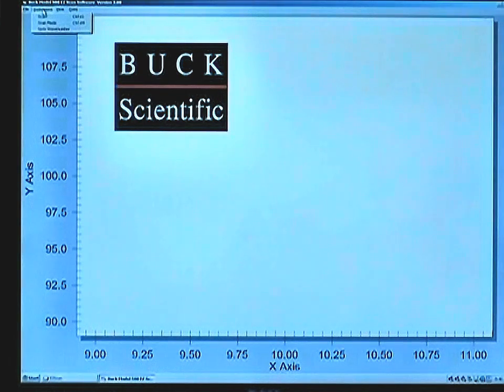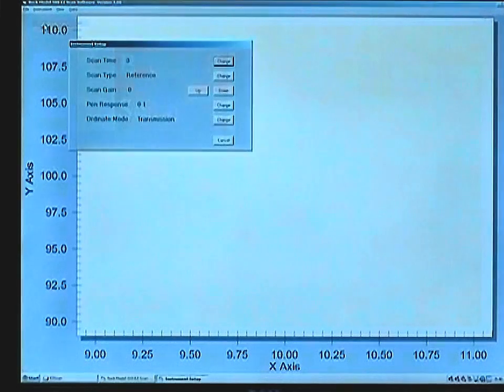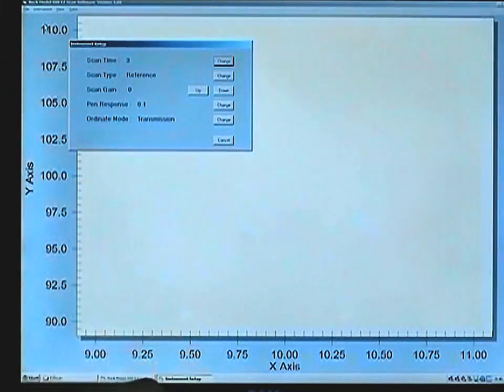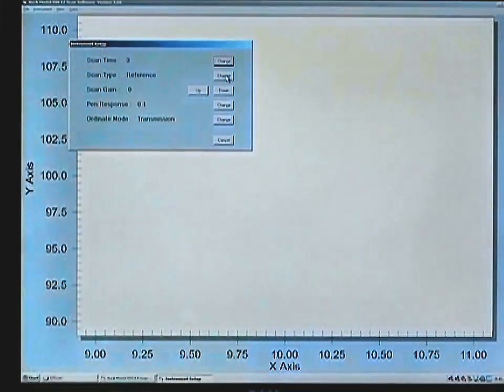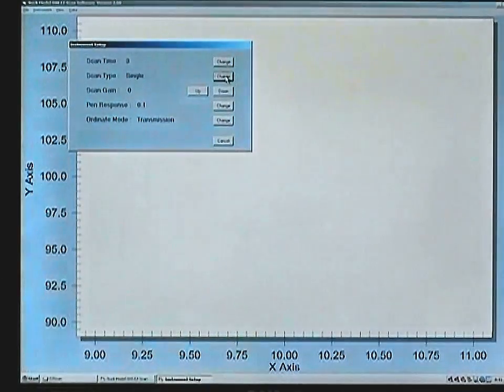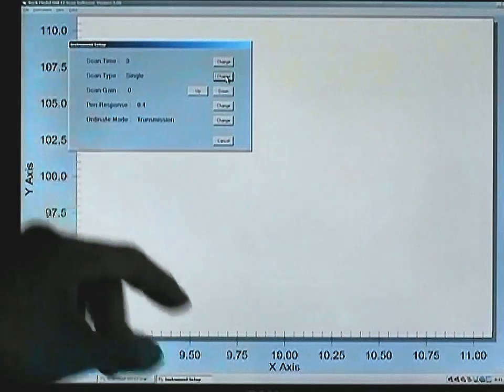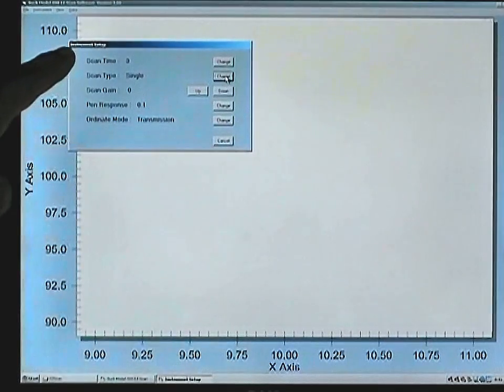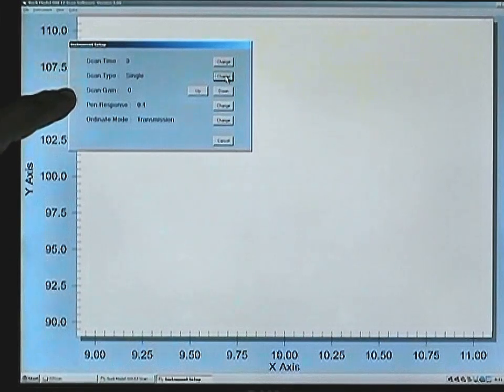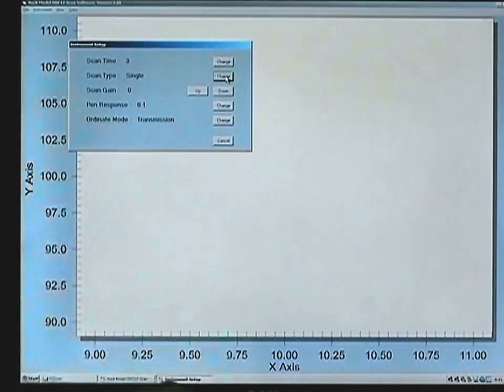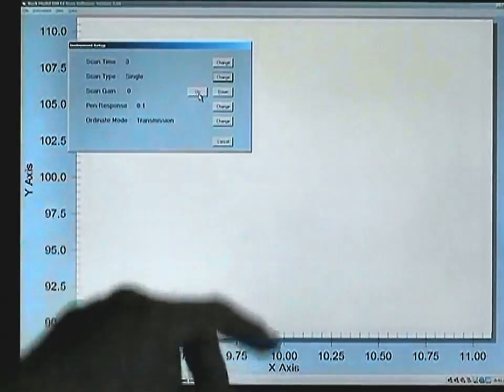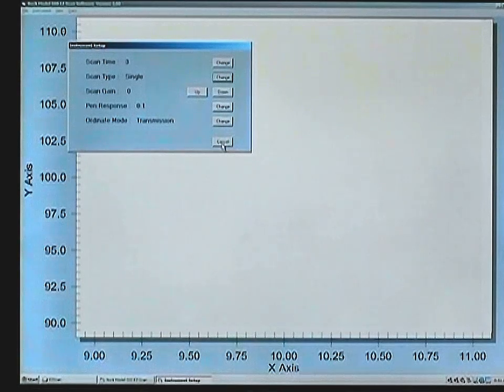You can go to Instrument, Scan Mode, and here's where you can change the parameters for the setup of the instrument. It is recommended to change the scan type from the default reference. Click on Change and set that for the single beam mode. Scan time of 3 is the usual default. A gain of 0 is useful most of the time unless you have an accessory with a tremendous amount of light loss. Then you can increase to a gain of 1 by clicking on the up icon. Cancel to exit this screen.